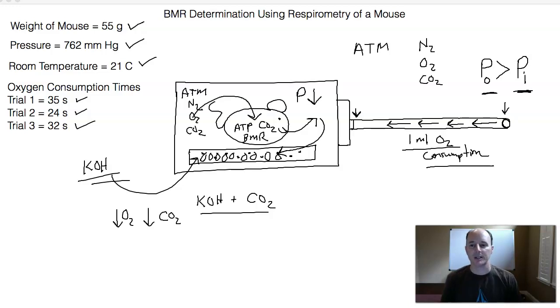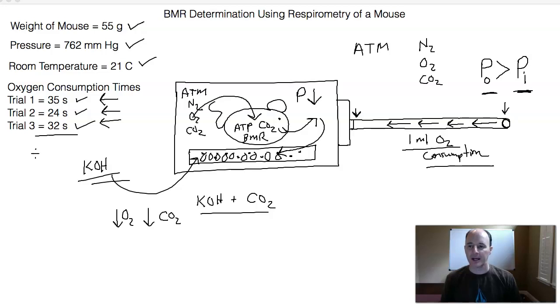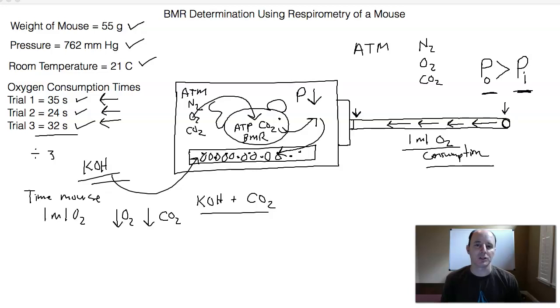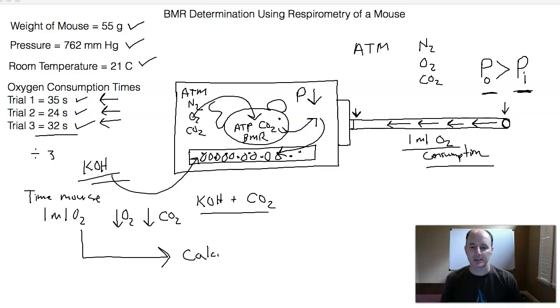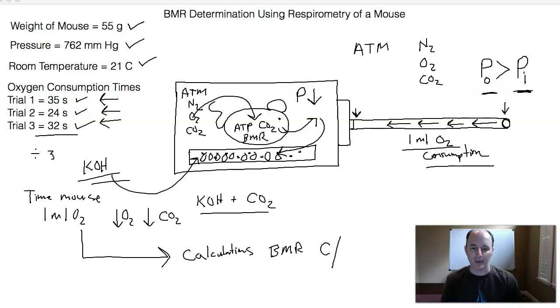We time how long it takes for the soap bubble to move from the end of the pipette down to the chamber — that tells us the time for one milliliter of oxygen consumption. We run this for one trial, then a second trial, and a third trial. We add up these numbers and divide by three to average out the time it takes for the mouse to consume one milliliter of oxygen. From there, we perform a series of calculations to determine the overall BMR of the mouse — essentially calories per hour.